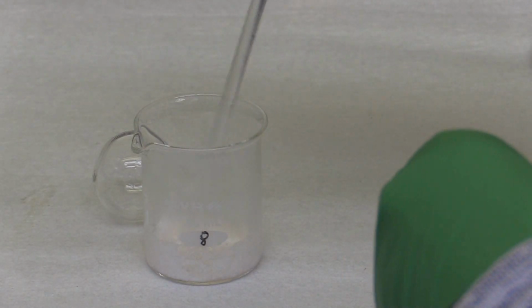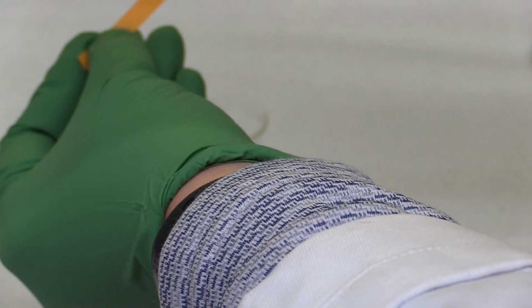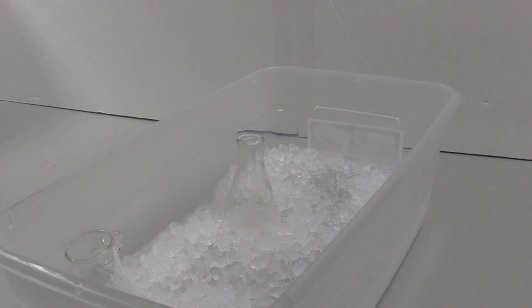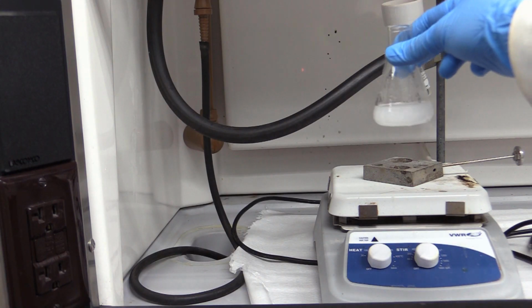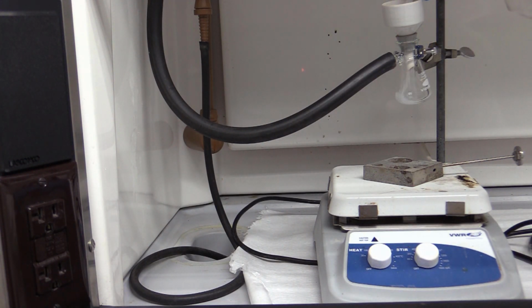Check the pH by stirring the mixture with a glass stir rod and dotting it onto a strip of pH paper. It should be around 2. Cool the mixture in an ice bath for about 10 minutes. Filter. Recrystallize with water.